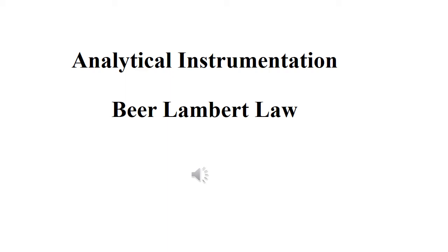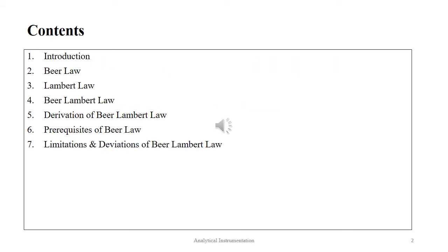Today we will talk about Beer-Lambert Law. In today's discussion, we will cover the following topics: introduction, Beer-Lambert Law, derivation of Beer-Lambert Law, prerequisites of Beer Law, limitations and deviations of Beer-Lambert Law.